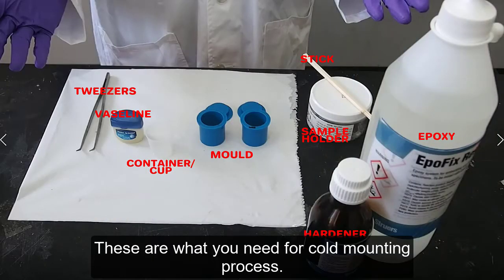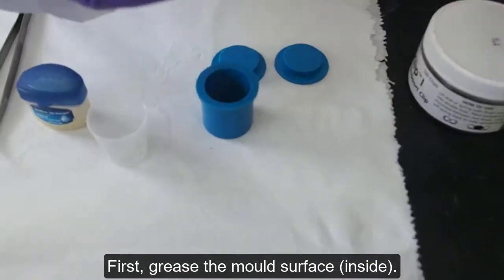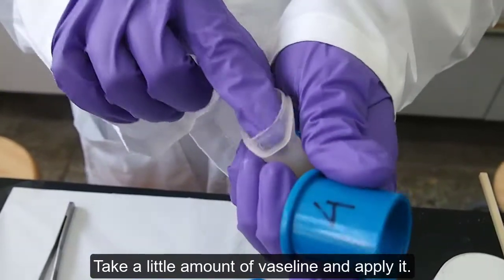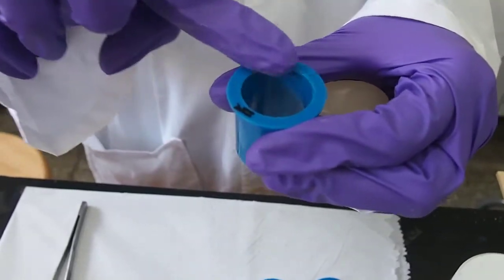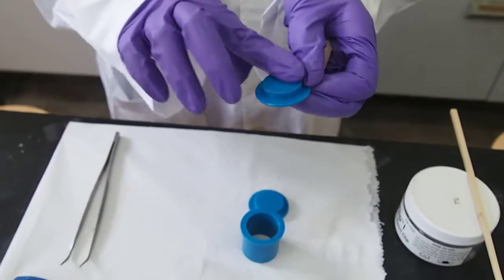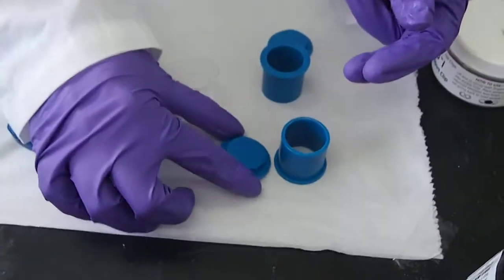These are what you need for the cold mounting process. Don't forget to wear the safety equipment because the resin will be harmful for your skin. First, grease the mold surface to prevent the resin from sticking to the mold. Take a little amount of Vaseline and apply it.